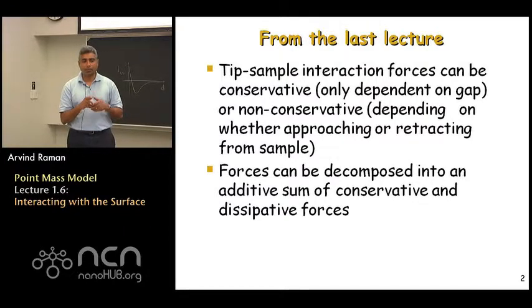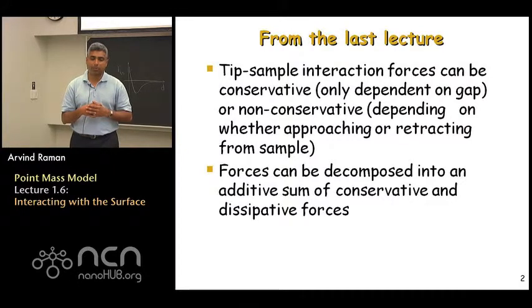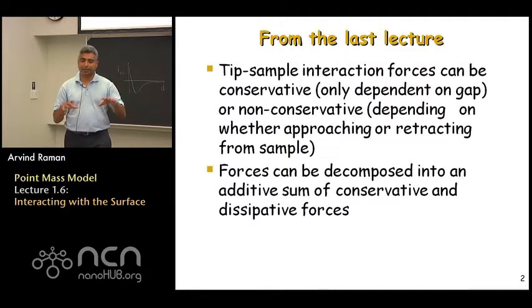The other component is the dissipative interaction, which arises from effectively many relaxation processes, many hysteretic phenomena that occur between the tip and the sample, which include, for example, the formation and breakage of capillary necks, formation and breakage of adhesive bonds between the tip and the surface, and the generation of phonons, heat, and friction.